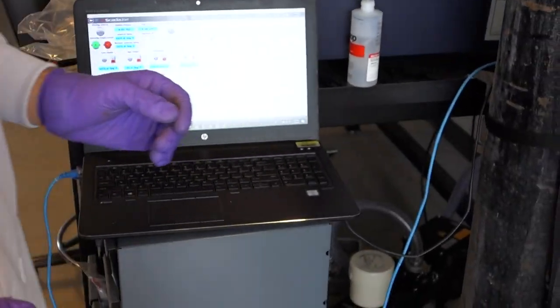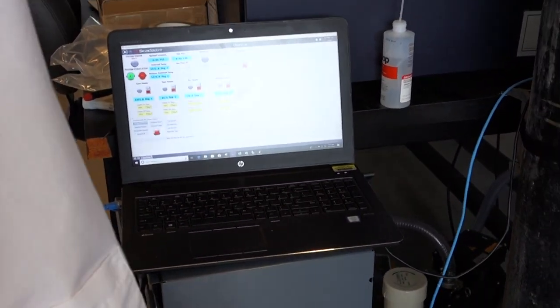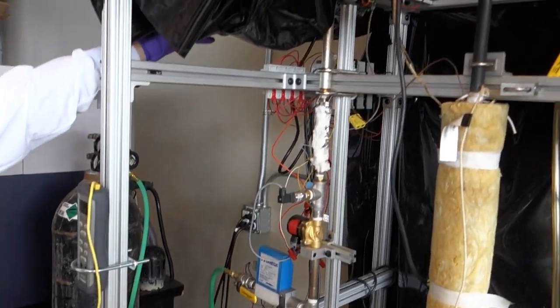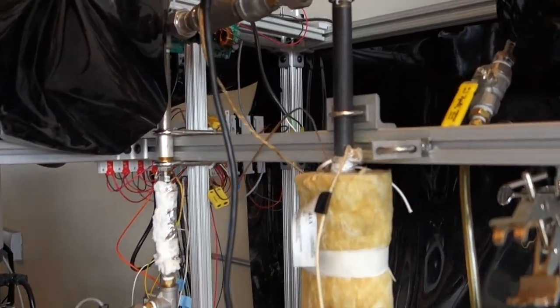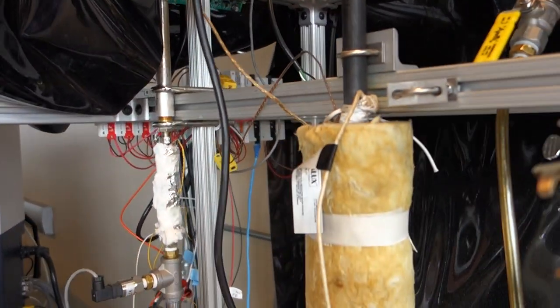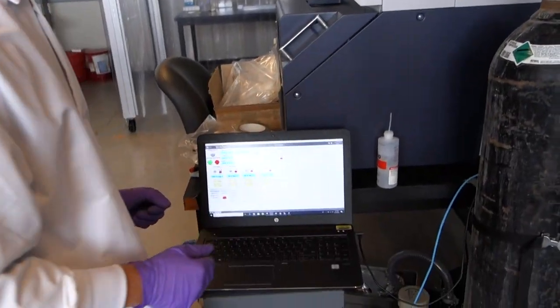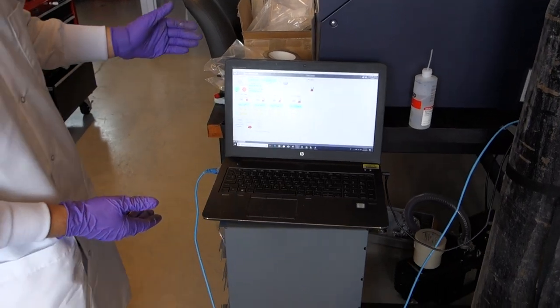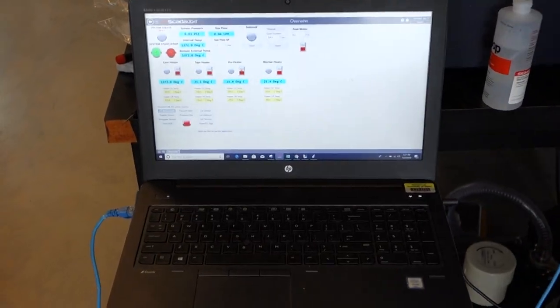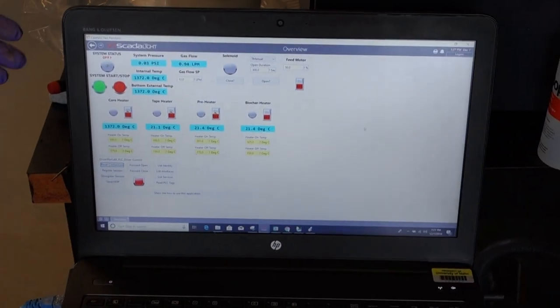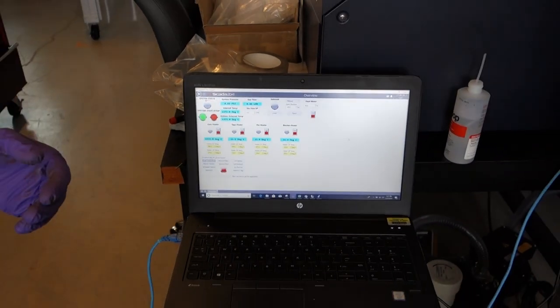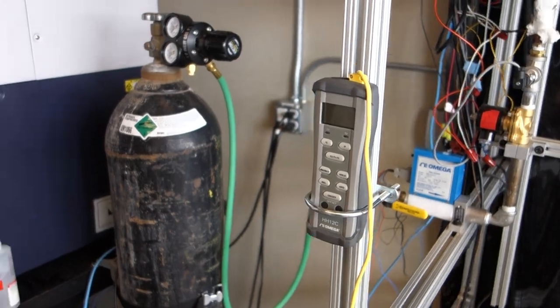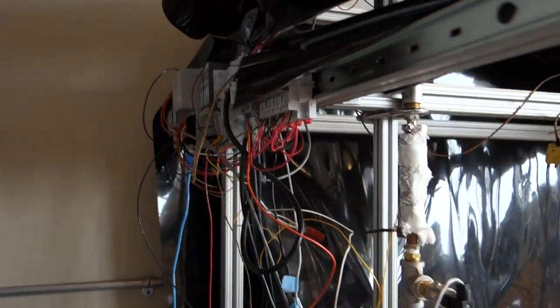It's kind of difficult to see, but all of these wires here allow process inputs and outputs to be monitored and controlled. And this is what we would call the HMI, or human-machine interface, which allows us to monitor and record all of the different data points, such as the temperatures, the pressures, the flow rates.